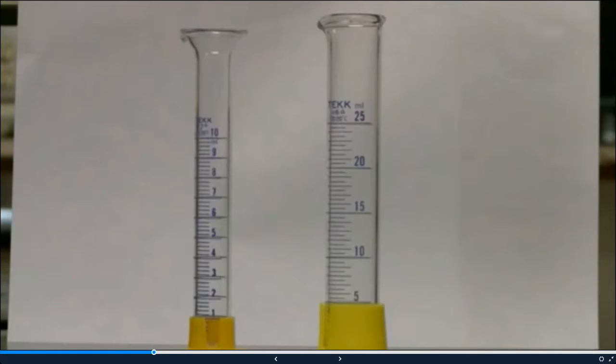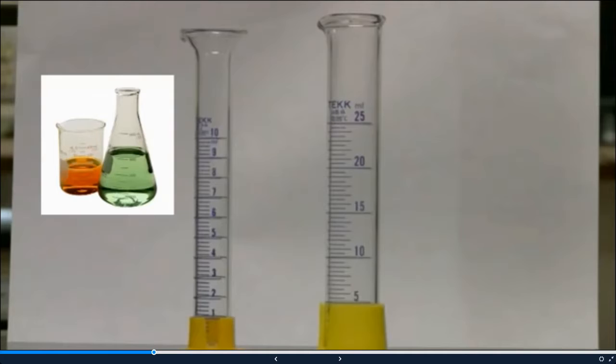We're going to learn how to measure liquids accurately and precisely using graduated cylinders. It's very important when you measure any type of liquid, you use a graduated cylinder. Do not use a beaker or a flask because those aren't calibrated to measure liquids accurately. The hash marks on beakers and flasks aren't as accurate and precise as a graduated cylinder — those are just general estimations.